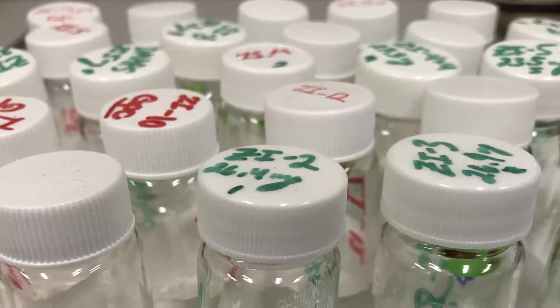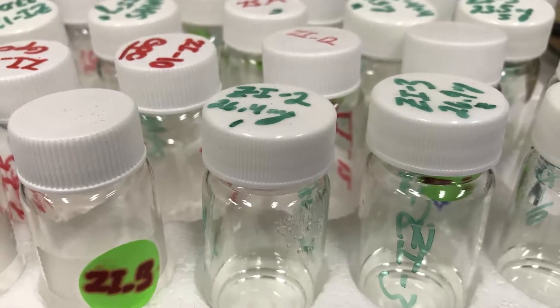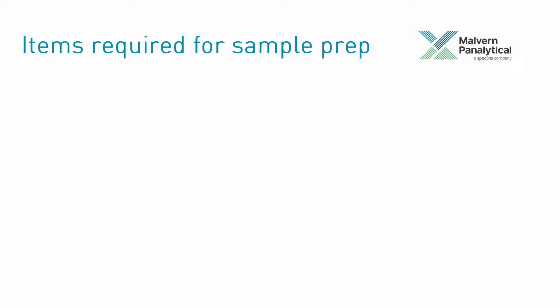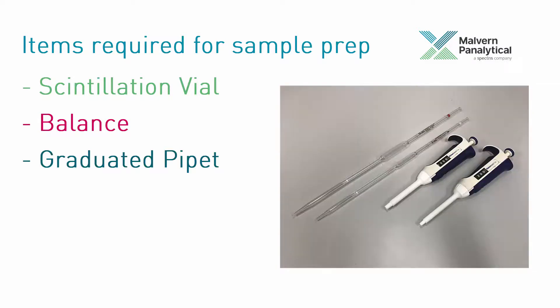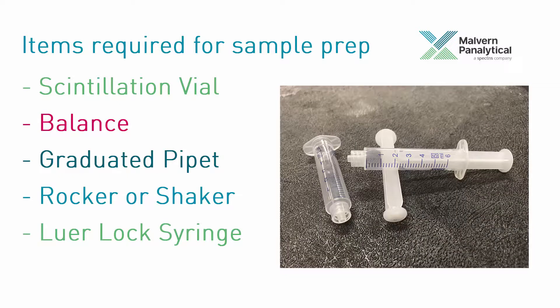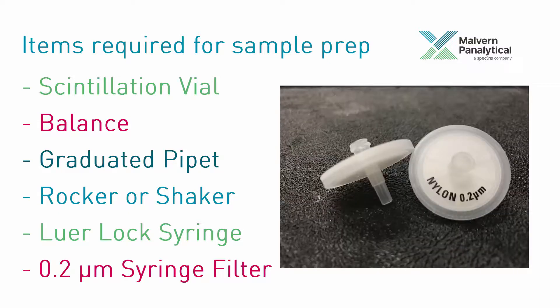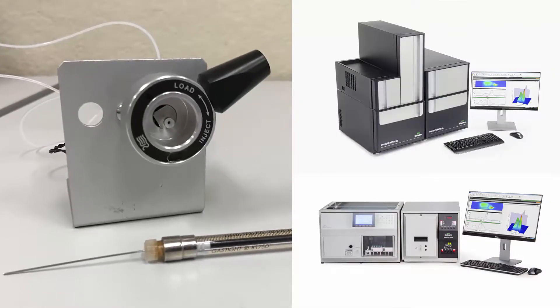In addition to ensuring sample solution homogeneity, considerations such as sample concentration and stability will be discussed. A common list of supplies for sample preparation includes a scintillation vial, a balance, a method of dispensing a known volume of dissolution solvent, a way to introduce gentle agitation to facilitate dissolution, a luer lock syringe, and a syringe filter. While the preparation method described here is applicable for both manual injector and autosampler systems, this demonstration will place the final sample solution into an autosampler vial.